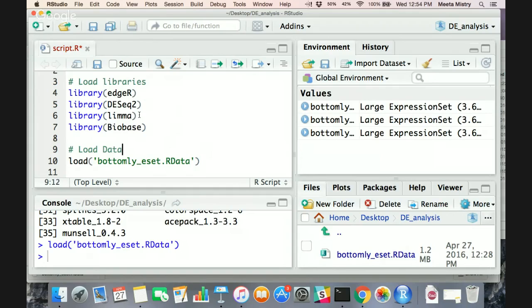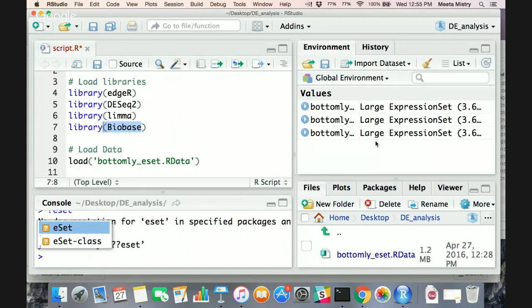Okay, so the way to create a new object is using the Biobase package, and I think the function is eset maybe. I can't remember exactly. I think it's something like you create new and then followed by eset. I can't remember the exact commands, but it's using functions that are available in the Biobase package. I think at break I can pull up the code for that.